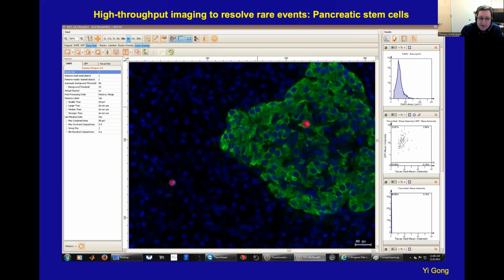And so we had scanned, and we were trying to use confocal, but it didn't work. And we used the ImageStream, it didn't work. They were just too rare. So we basically put all of the cells, like 2 million cells, on a cover slip, and then scanned many cover slips, and we did it at 100x oil immersion, and we got about 200 cells from that particular scan. So it was enough for the paper. So even really rare events, you can take advantage of this platform.